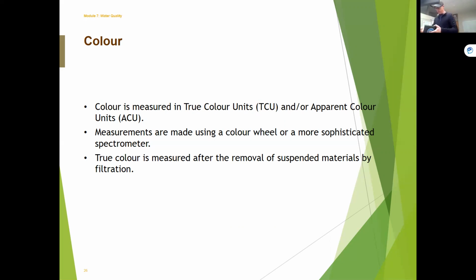And these were used quite a bit. I don't think these have been used recently. So this would be typical. Inside here, there's a color wheel, and I can spin the color wheel. What I'm going to do is put in a vial of water that's probably distilled, and that's my blank, and then I'll put in another sample, which would be my sample, and I'd hold it up to the light and look at these two windows, and I'd spin the color wheel to the right color.